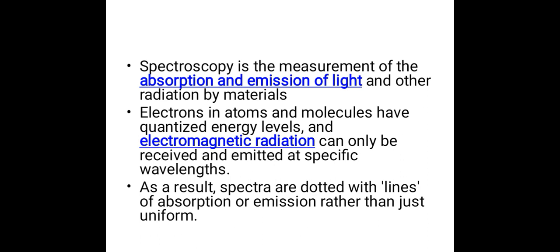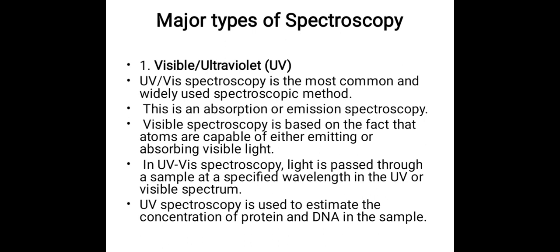Principles behind spectroscopy. Spectroscopy is based on the principle of Beer-Lambert's law. According to this law, when a beam of monochromatic light is passed through a sample solution, the intensity of absorption is directly proportional to the path length of the light and the molar concentration of the solution, and this is given by the equation, where the terms are: absorbance, molar absorption coefficient, molar concentration, and optical path length. So what is the principle behind spectroscopy? Beer-Lambert's law.